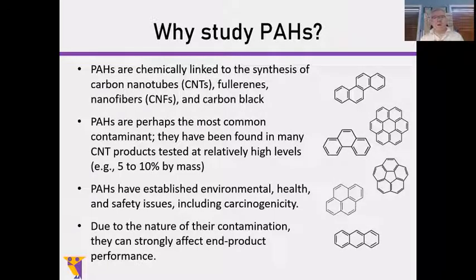So understanding something about PAHs, specifically, at least in the beginning, how to measure them, how to detect them, quantify them, is very important in understanding how nanomaterials work, or at least nanomaterial products work, and what obstacles they may have to getting them to work successfully.